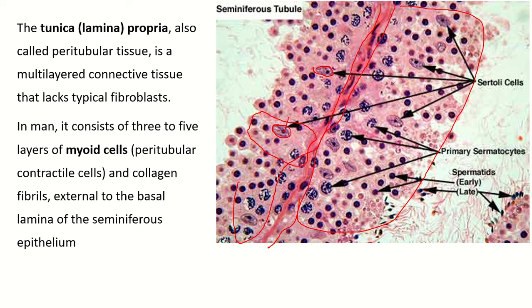This is another Sertoli cell nucleus — it contains a very big nucleus with prominent nucleolus. These are the locations of other Sertoli cells. The Sertoli cell, like a mother, holds the spermatogenic cells. All of these are the spermatogenic cells.